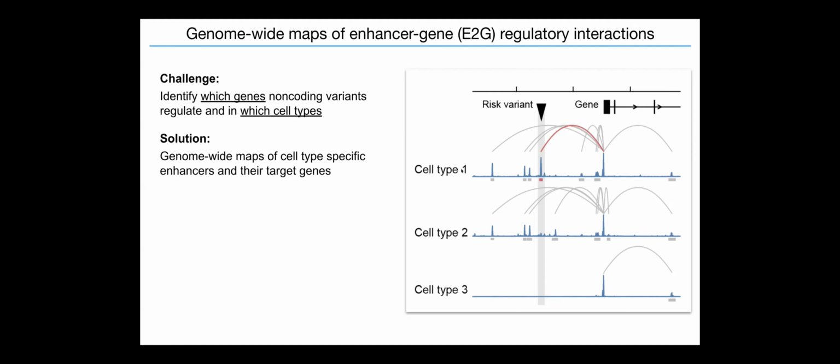Then, for the different cell types we're looking at, we have different annotations. We have these tracks that show, in the little boxes, annotated enhancer elements in the genome of these cells, including some molecular assays that have been used to characterize these elements, such as DNA accessibility measured by ATAC-seq, which is often used. And most importantly, we have the connections that link these enhancers to their target genes.